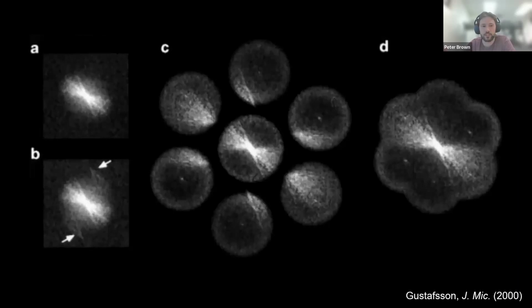How does this look in an experiment? Well, here's a figure from one of these early papers. In panel A, you can see the spatial frequency spectrum of our wide field image. And B is a raw image from the SIM. You can see out here, we have a peak coming from our SIM pattern, and this is mixing additional spatial frequency information into our picture.